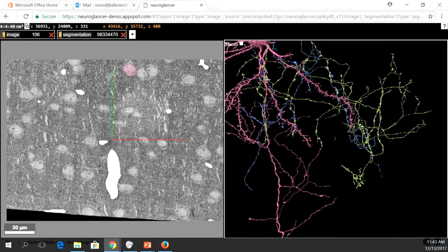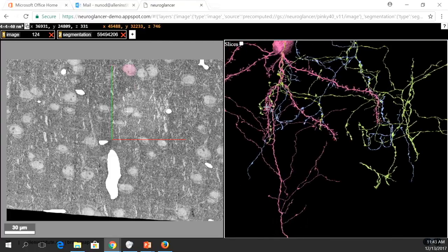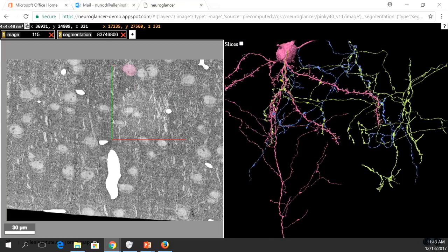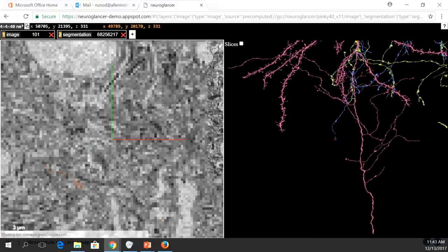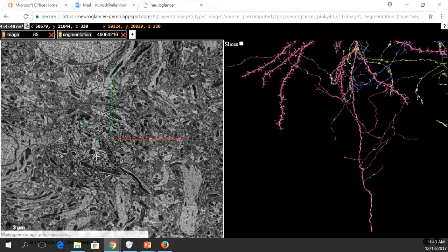Do the other cells that these inhibitory cells target have similar receptive field properties, or are they, like the basket cells, just a sample of all different orientations of these similar receptive fields? And then again, you could go to every single axon and pick one, however you want. You can zoom in and visualize the structure, which is too slow here, but you are welcome to come to us and surf on our laptops.